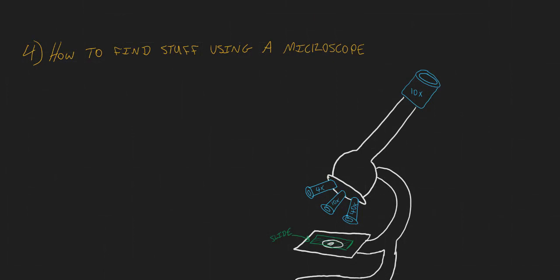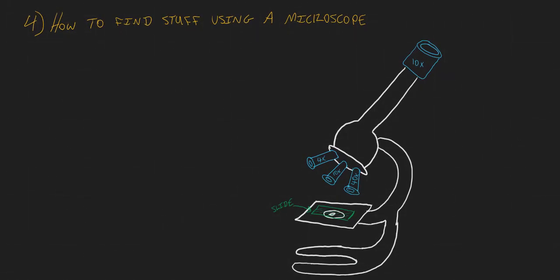Now, when you go about using a microscope, there are a few key parts you have to pay attention to in order to understand exactly how much an image is being magnified. Those parts of the microscope are referred to as the lenses. There's 2 different types of lens. First, there are the ocular lenses, which are right next to your eye.